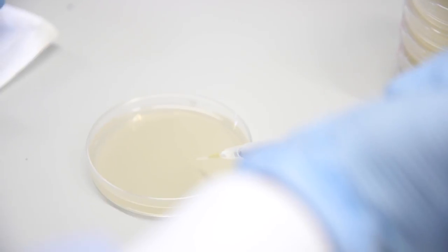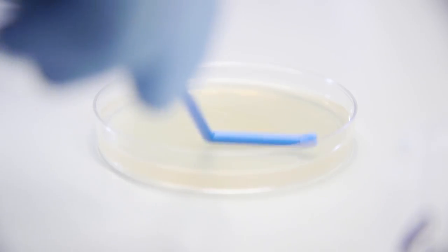The modified plasmid is put back into bacteria using electroporation again and then plated up.